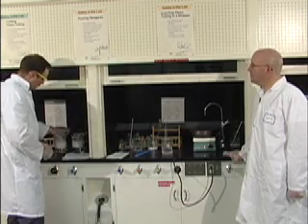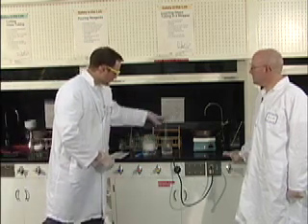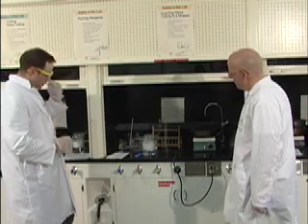you're going to make an ice bath. For the 30 minutes, you're going to throw it into an ice bath. Now, the way this looks, a little dangerous, doesn't it? Yeah, a little dangerous, but not so bad.